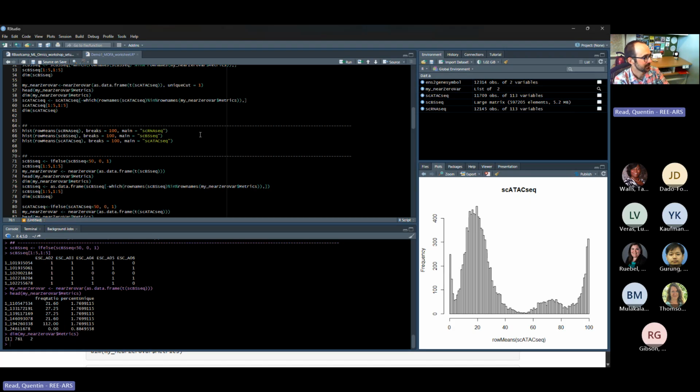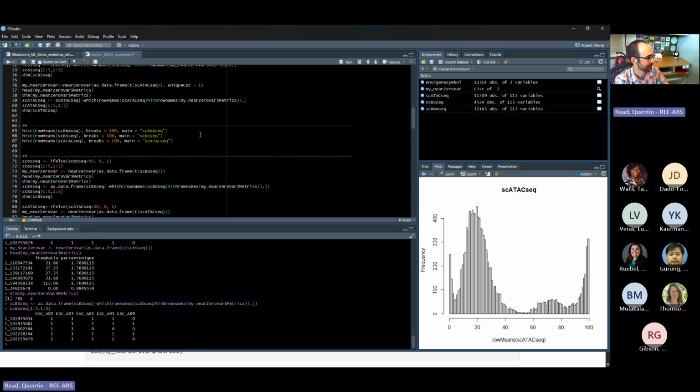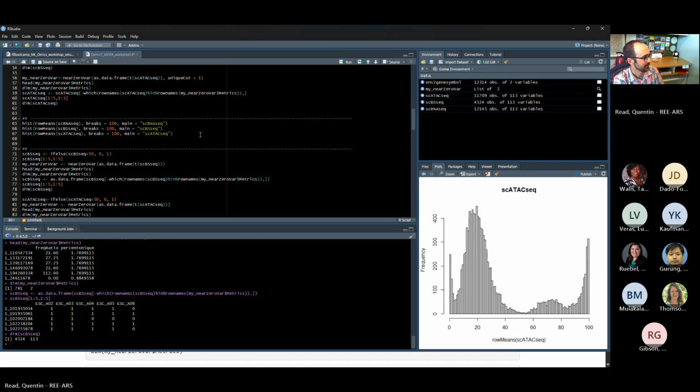So the next line gets rid of those rows from the data. Again, just take a quick look to make sure we didn't mess things up and delete all the data. Okay, the data are still there, but less. And how big is it now? We're down to 4,500. Where we started at 8,000, we went down to about 5,000, and now we're down to 4,500.